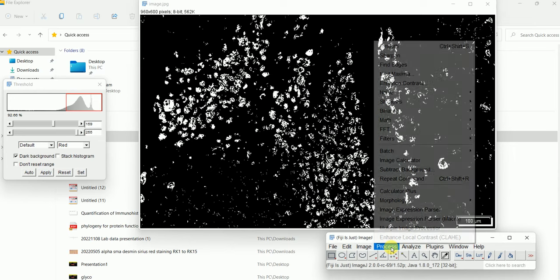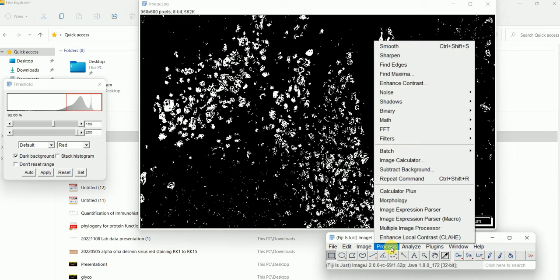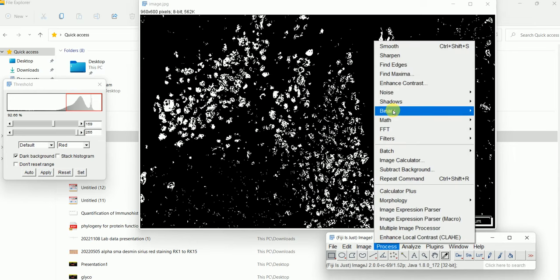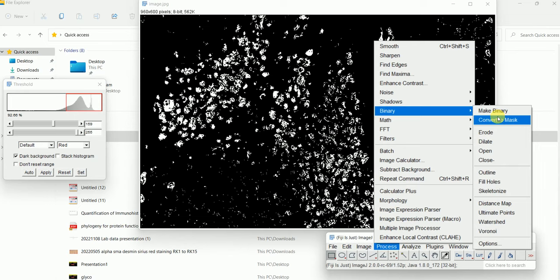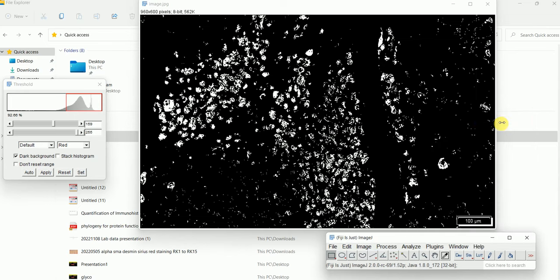Then again go to Process, then Binary, then Convert to Mask. Basically all the background will be masked by using this feature.